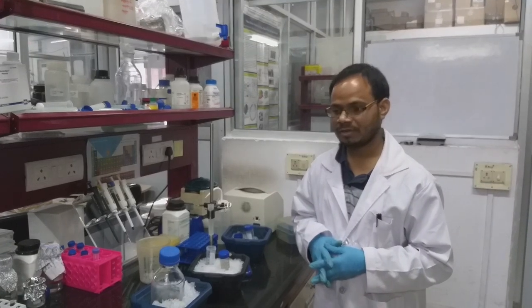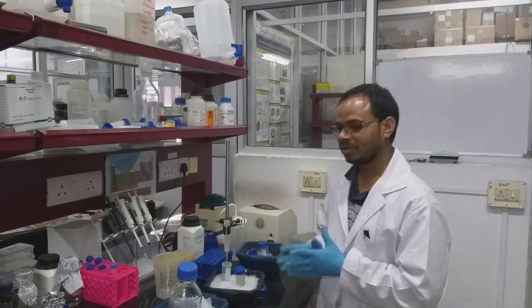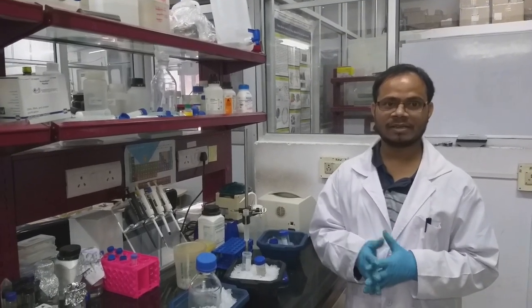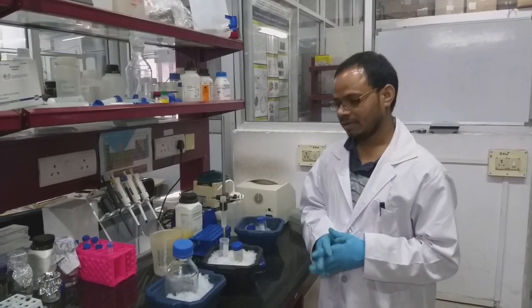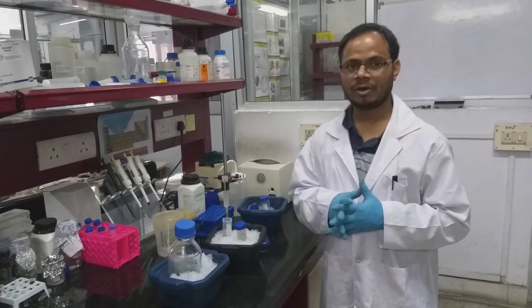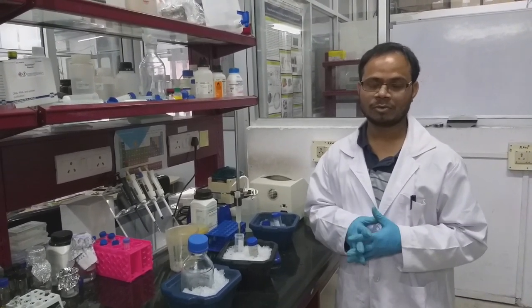While doing purification, we have to remember that every time you are introducing a new buffer, you have to collect the fraction, and this can be used for running SDS gels and testing the purity of the samples. And also the flow through part and the washing part that we have collected, we have to keep it safely. After verification of the gel, only then we have to throw it.